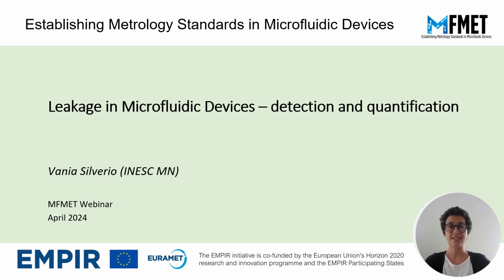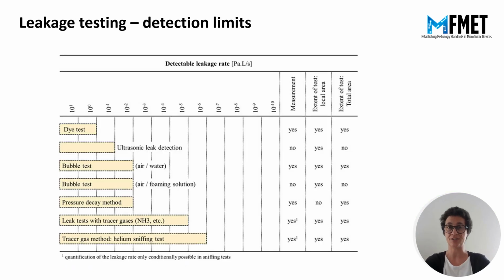This work is part of MFMET, for establishing metrology standards in microfluidic devices, a European project financed by EMPIR. I am Vânia Silvério from INESC-MN, and I'm going to talk about leakage in microfluidic devices, the detection and quantification.